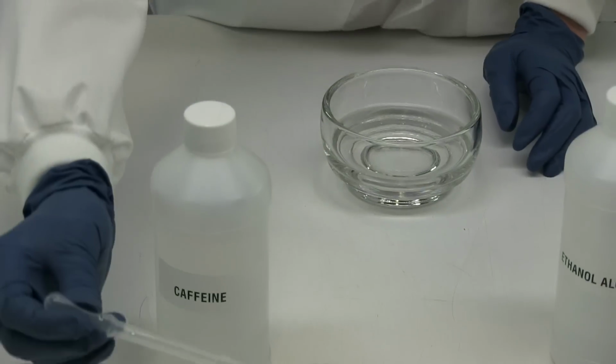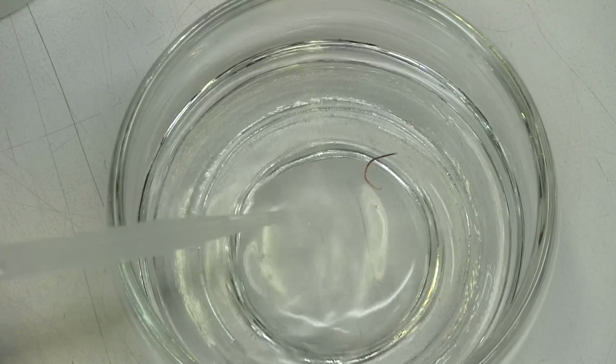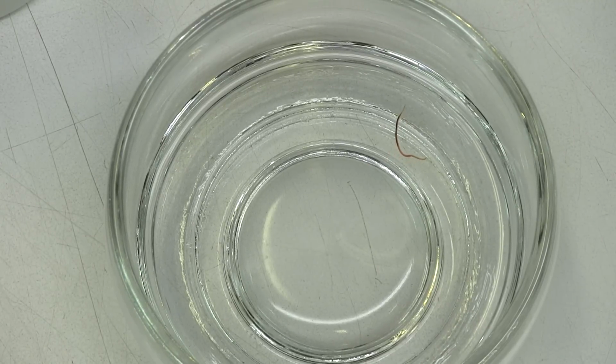The second toxicant we're introducing to the blackworm is caffeine. You might see them appear overactive, show greater sensitivity to probing when swimming and crawling, and they might try to curl in a ball and then stretch out.